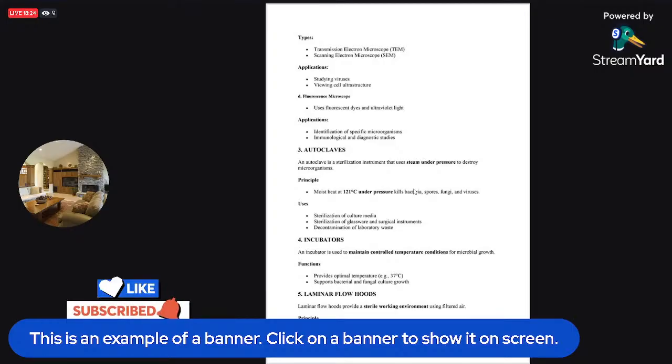So under normal circumstance, its function is to provide optimal temperature, unlike room temperature. It's not every time that the room temperature is 37 degrees centigrade. There are so many times that sometimes it may be low and sometimes it may be high. So if microorganisms exist in a condition where the temperature cannot be controlled, that is not proper for them, and you see them behaving differently.